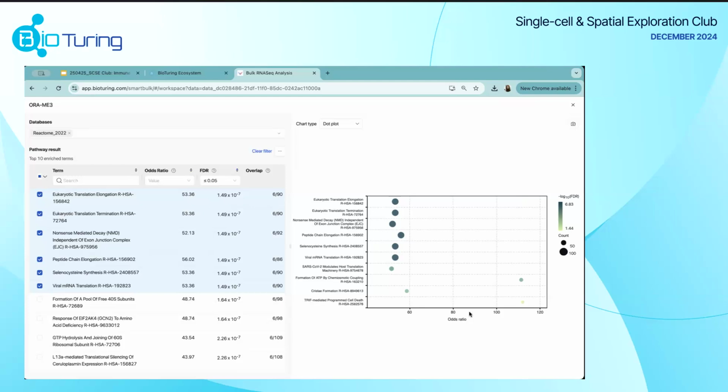Okay, so what does this mean on the larger scale? We can see that ME3 is a module that has been identified to be specific to this ARDS post stem cell transplantation group. We're able to see that this specific module has these core transcriptional programs when it comes to the reactome pathway system that have this immune dysregulation, and this might lead to differences in proportions in granulocytes that might likely be reconstituting different cells in the blood. It might mean that there's some metabolic priming or an antiviral response post-transplant. So these are some key analyses that you can gather.